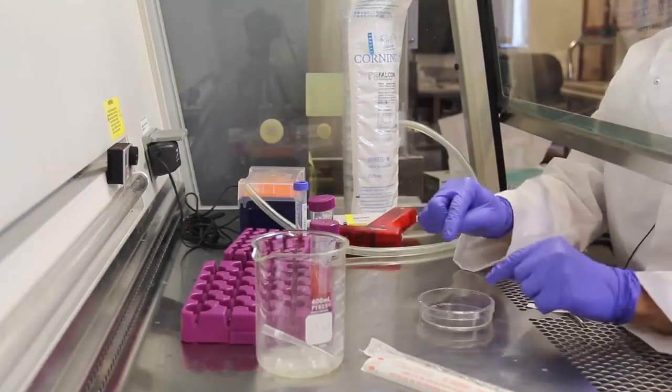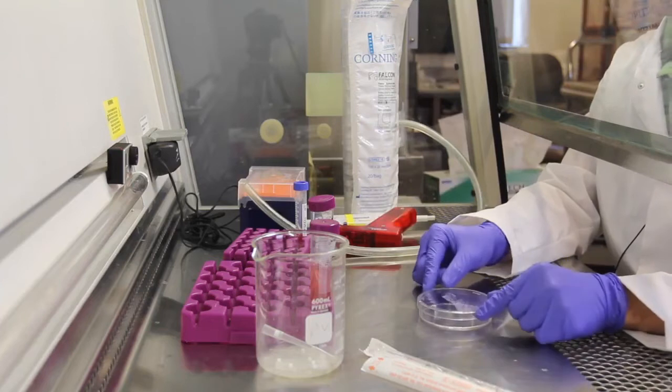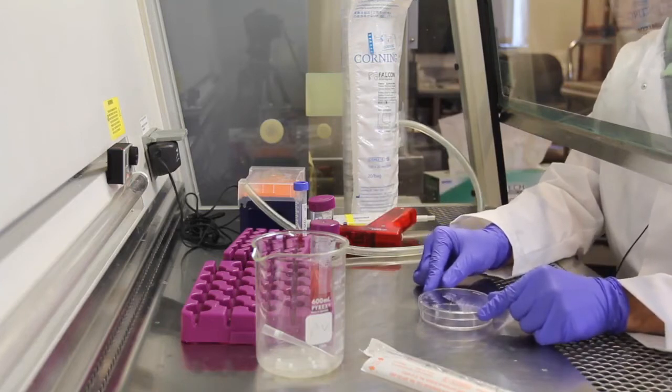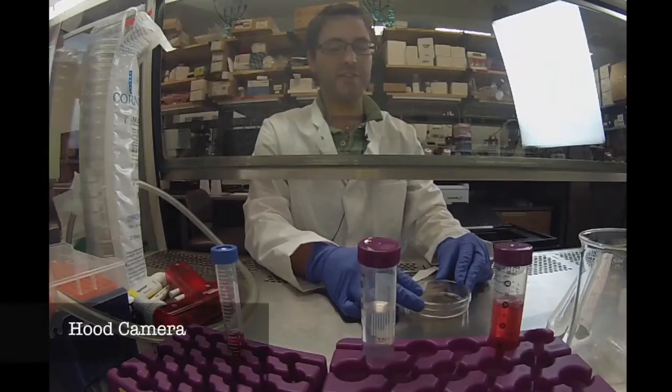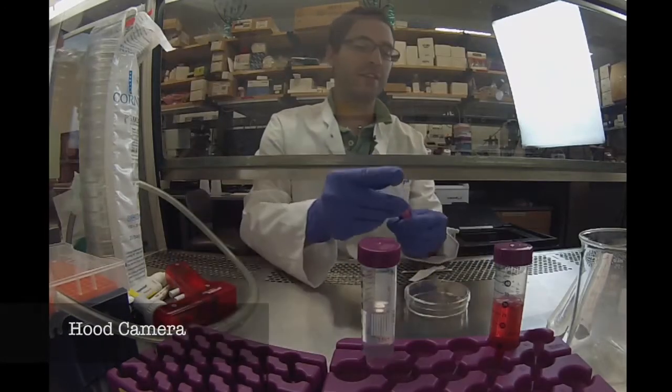All of the healthy cells are currently still on this plate and they're attached to the bottom of the plate via extracellular proteins. So the way to lift the cells off of the plate is to digest those extracellular proteins using trypsin.